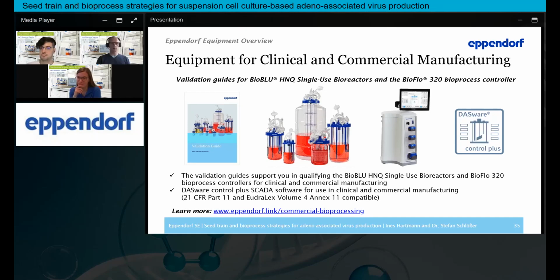All right, thank you very much, Ines. The next one I can see is for Stefan. Good question. Why were single-use bioreactors used in this study and not glass bioreactors?